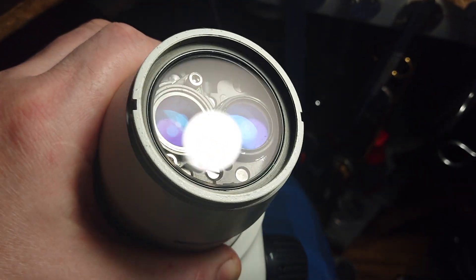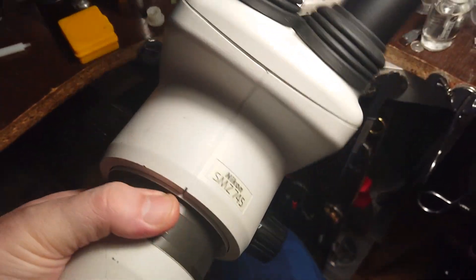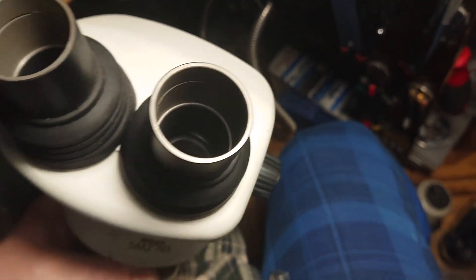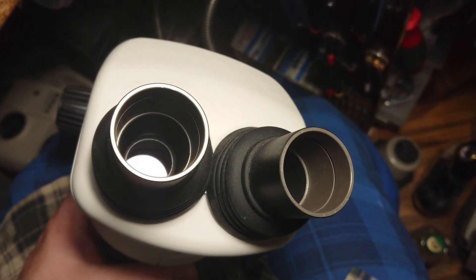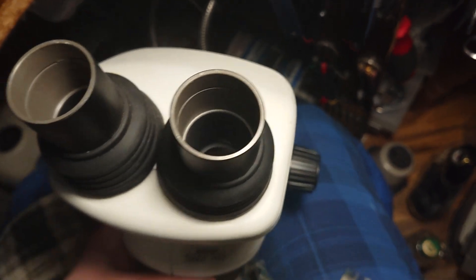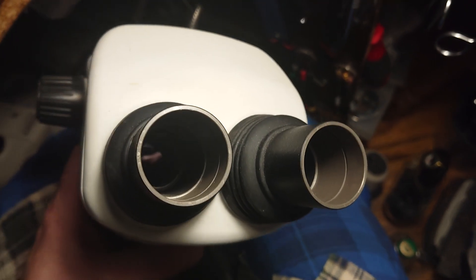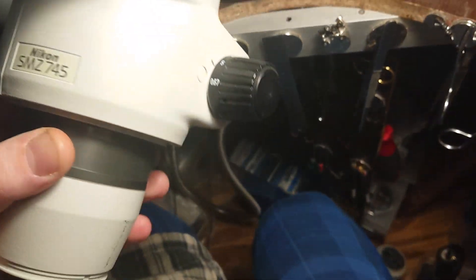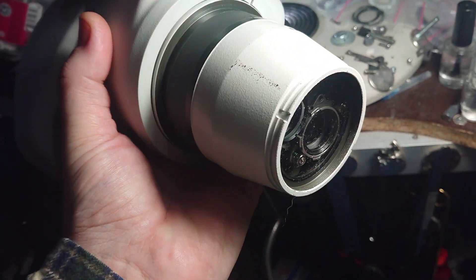It would be better to replace this protective glass with a proper well-coated one — which I'm doing with this microscope. The body is in decent condition as usual, and the same applies to the outer protective glasses. The customer can decide whether to remove them or replace them with properly coated ones. That's all for the evaluation — we'll see how it looks inside once I finish working on it.